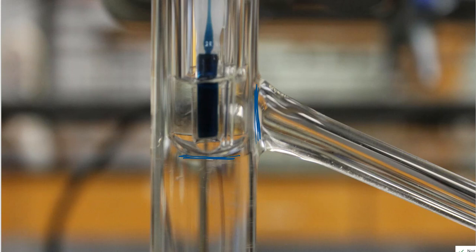Additionally, if I take a look at my thermometer bulb, I really like to cover the bulb up as much as possible. Now, sometimes we don't have that much liquid in order to do that. It causes us some problems sometimes, but that's okay. The other thing is that this thermometer has an immersion line, and I am very far away from the immersion line, folks. That immersion line is the proper level that my liquid should reach in order for my thermometer to report an accurate reading. So if we get a boiling point that's slightly off, then this could be one of the reasons. I'm not at the immersion line of the thermometer, and that could be a problem.